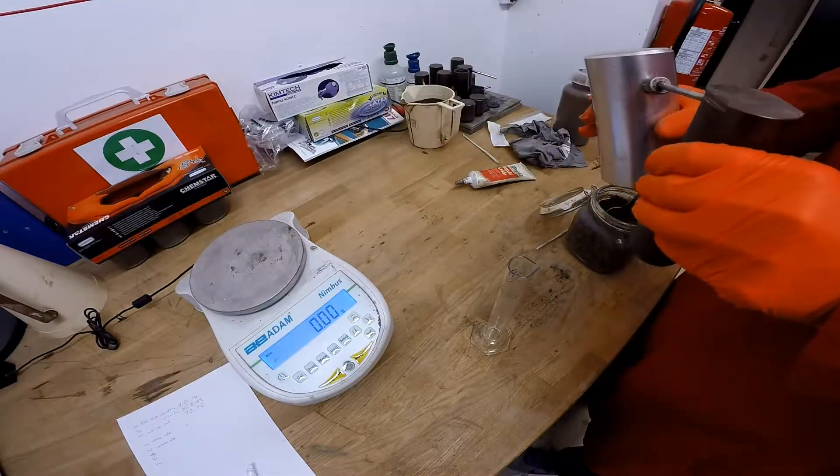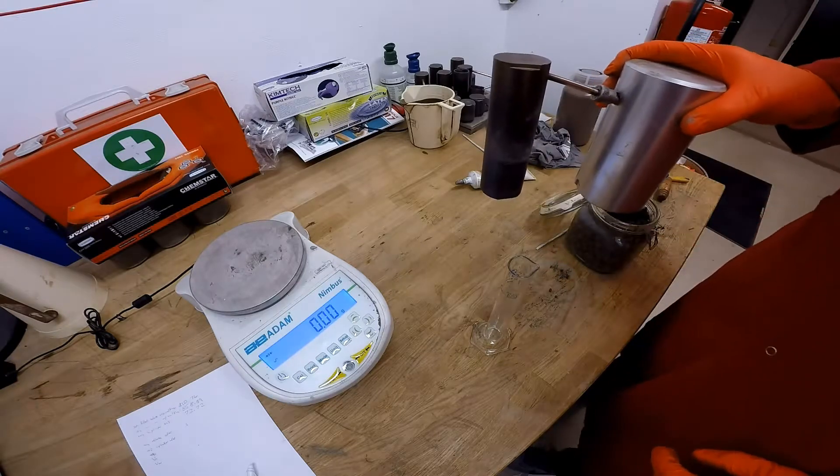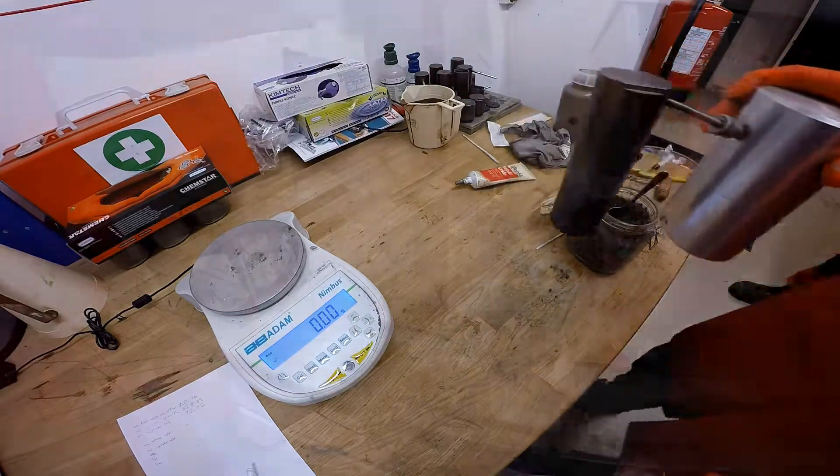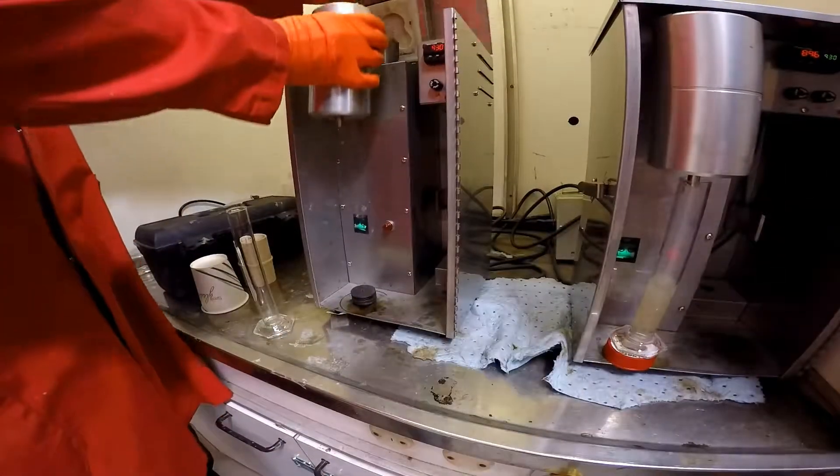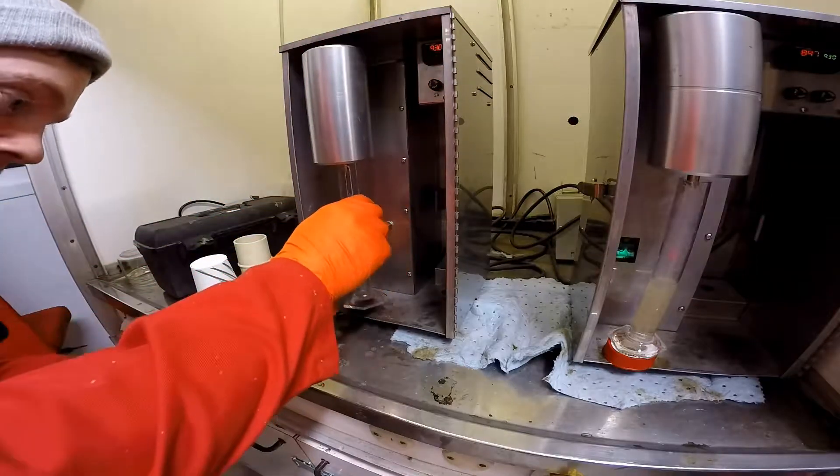Now take the other end of the retort, screw it on. Just put it all the way in, back off a little bit, and screw it on. We'll go put it in the burner. This will take around 45 minutes to an hour to burn.